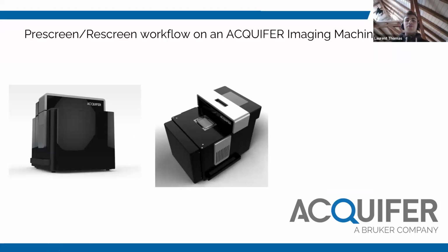It's an inverted wide field microscope, the imaging machine that's represented here. On this system, the sample holder is fixed and the lid moves on top, so there's no perturbation of the sample. So it's ideal for non-adhesive samples and time-lapse imaging of living organisms, for instance.